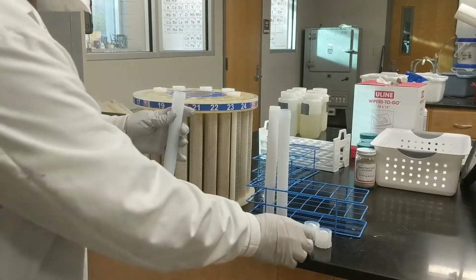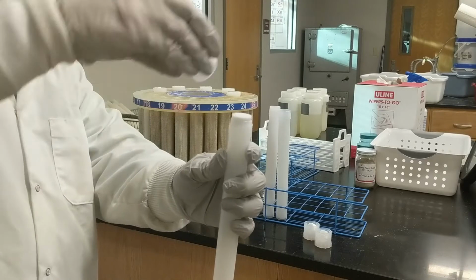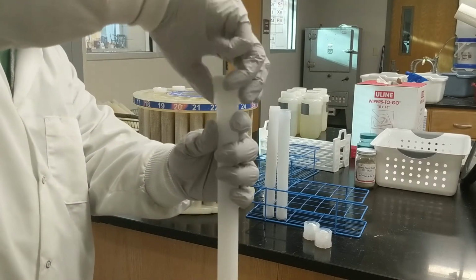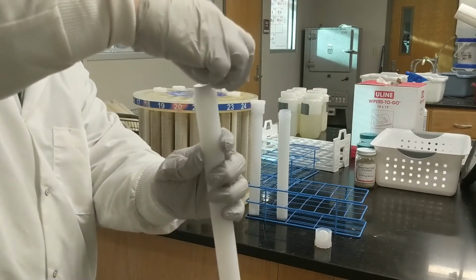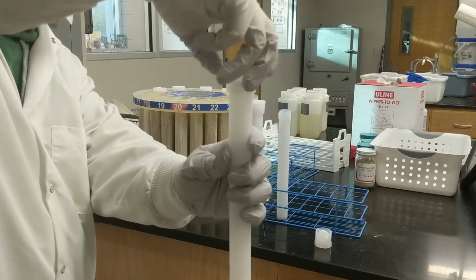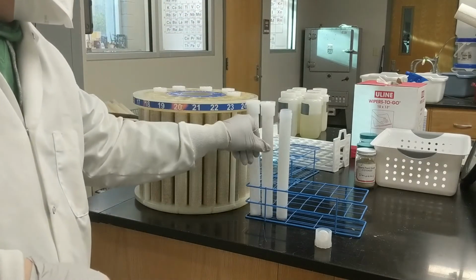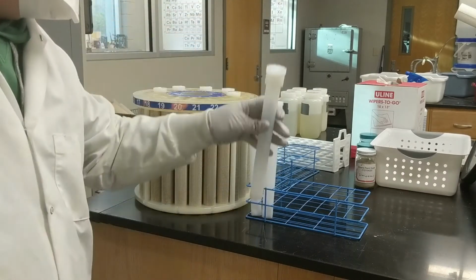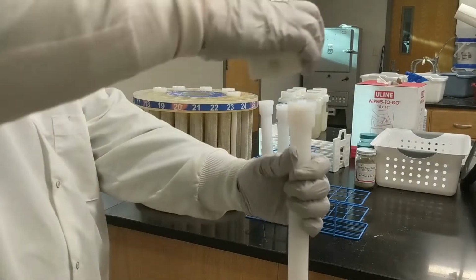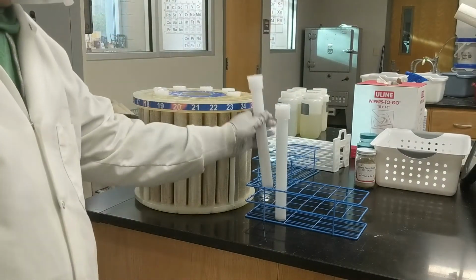After adding the acid, the next thing to do is to cap the microwave vessels. You can see we put the stopper down in, screw the cap on. I'm going to do that for all three of these. And then, once the cap is on, you take the little tool that comes with the microwave and put it on the cap and twist until you hear 2 clicks. So you'll hear that right now. Then you can put the tube into the carousel in its designated spot.